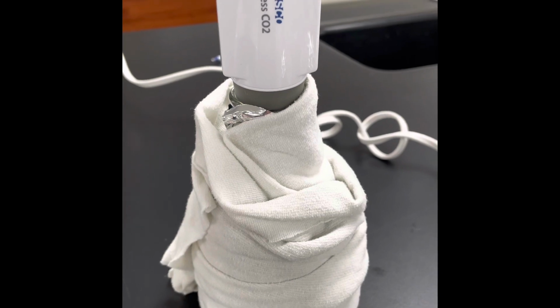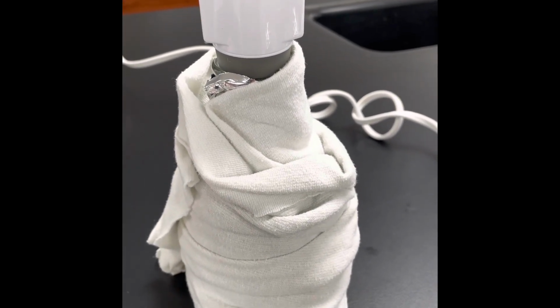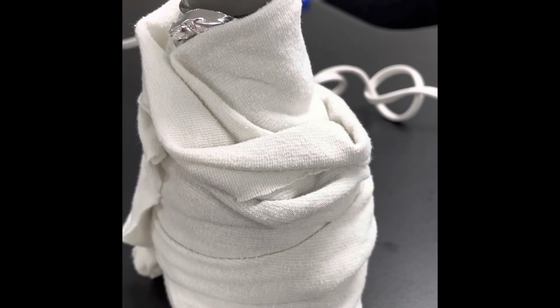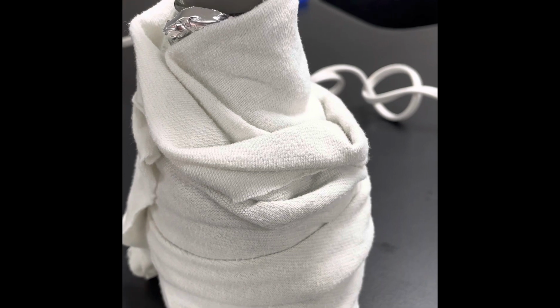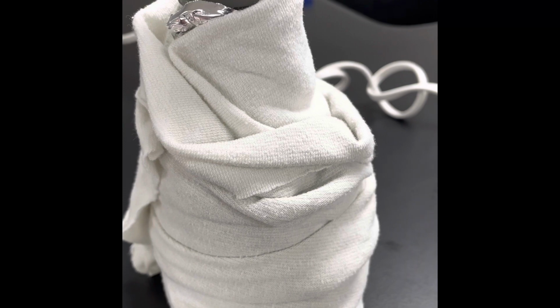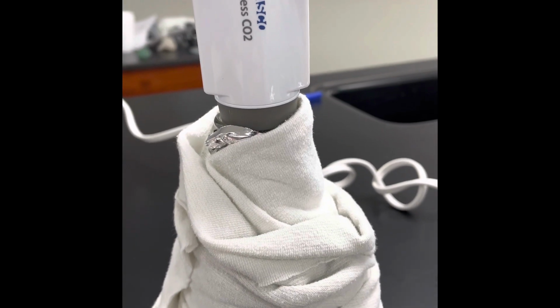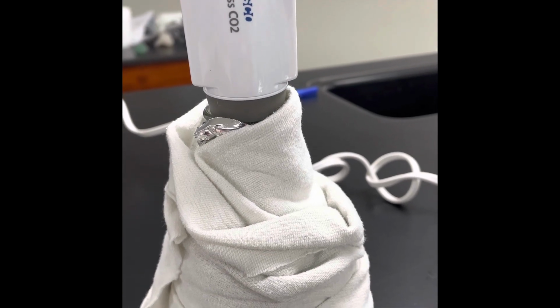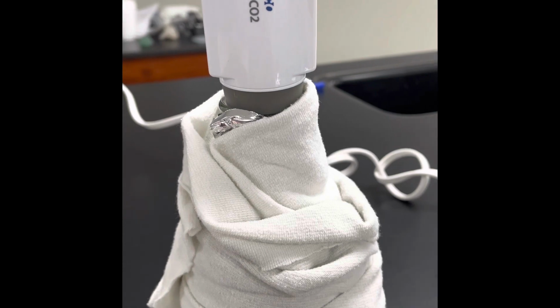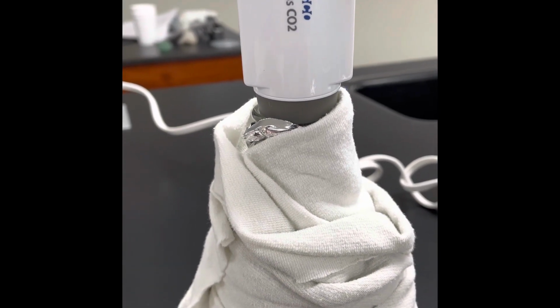All right, here is the container with the leaves. I wrapped it in foil, and then just to really make sure that very little light gets in there, I wrapped it in this cloth. I also opened this to start over now, so let air back into it, and let's take a look. Let's start collecting and make a prediction.